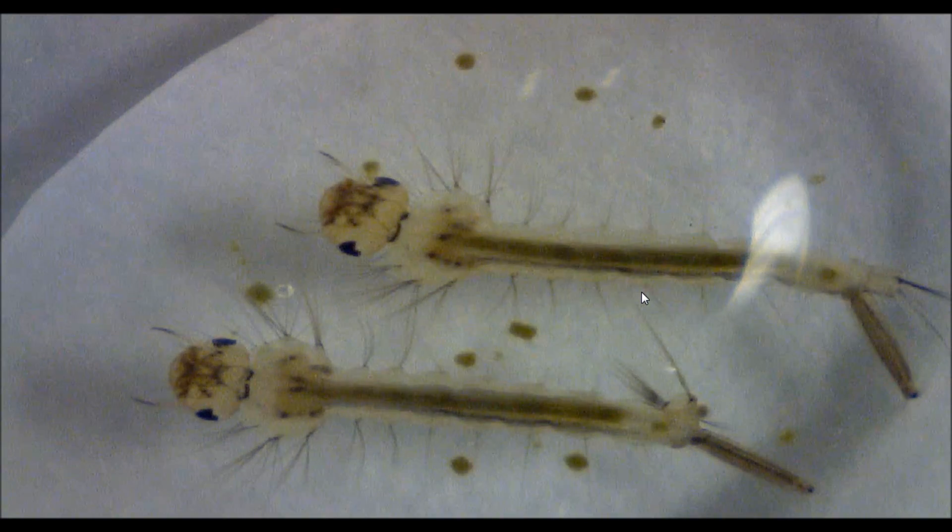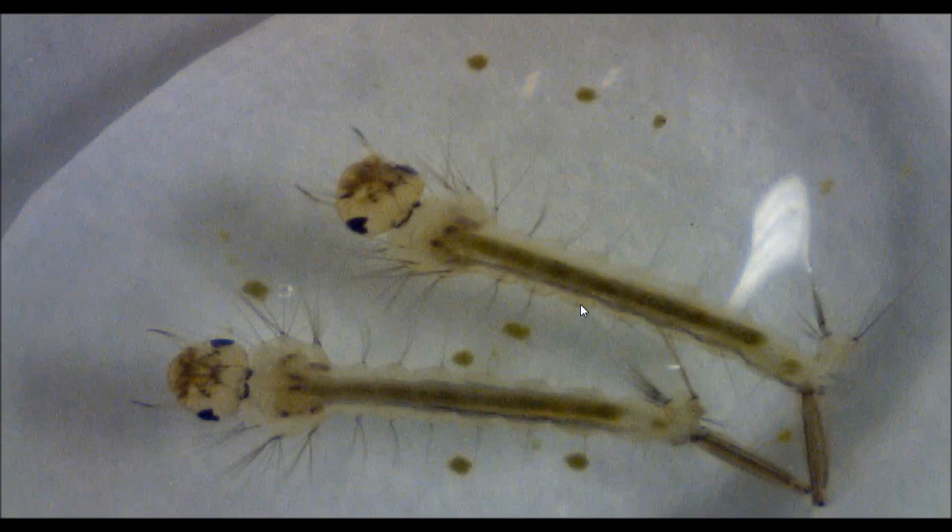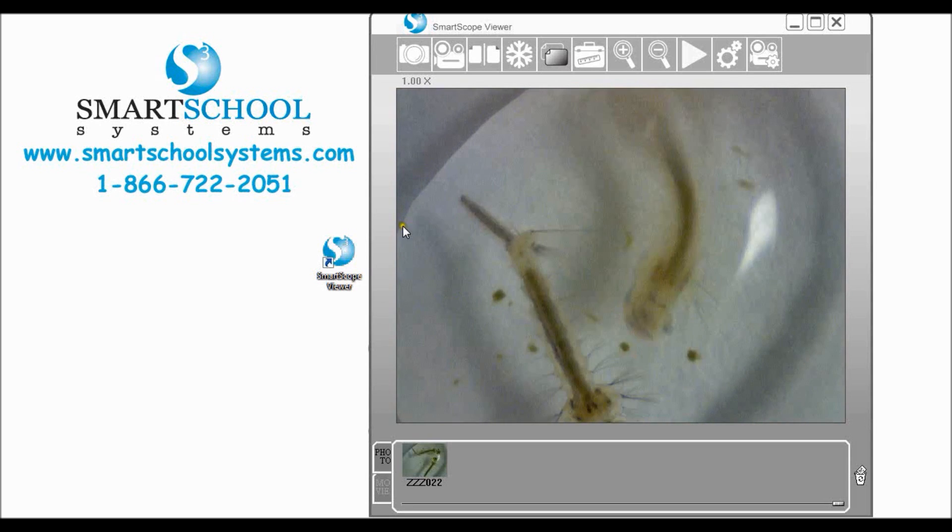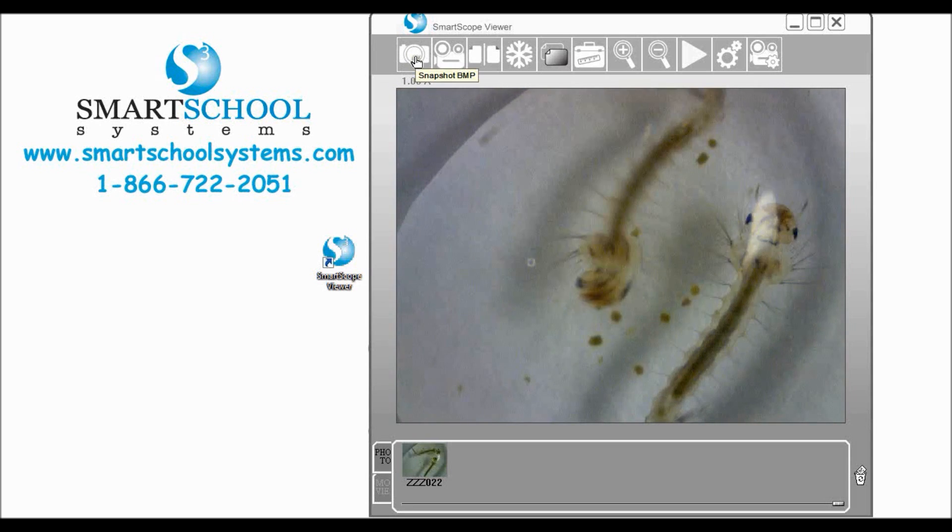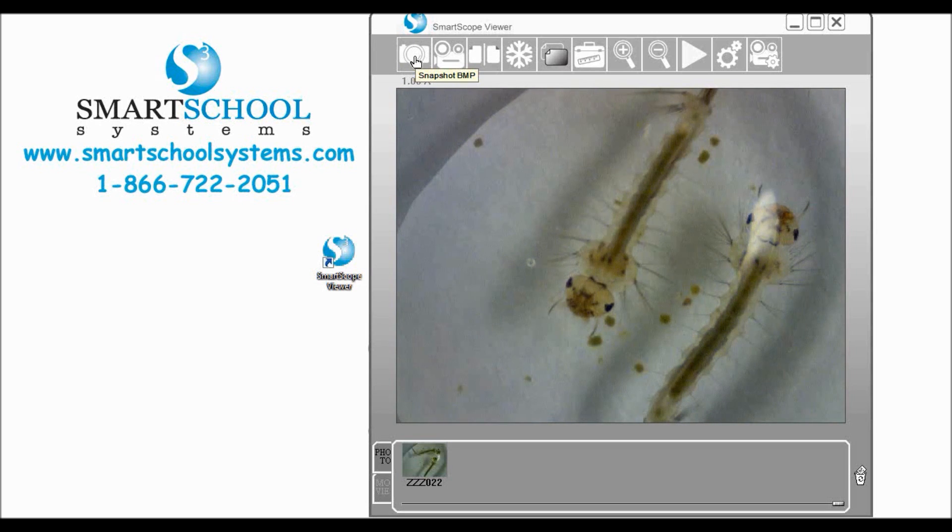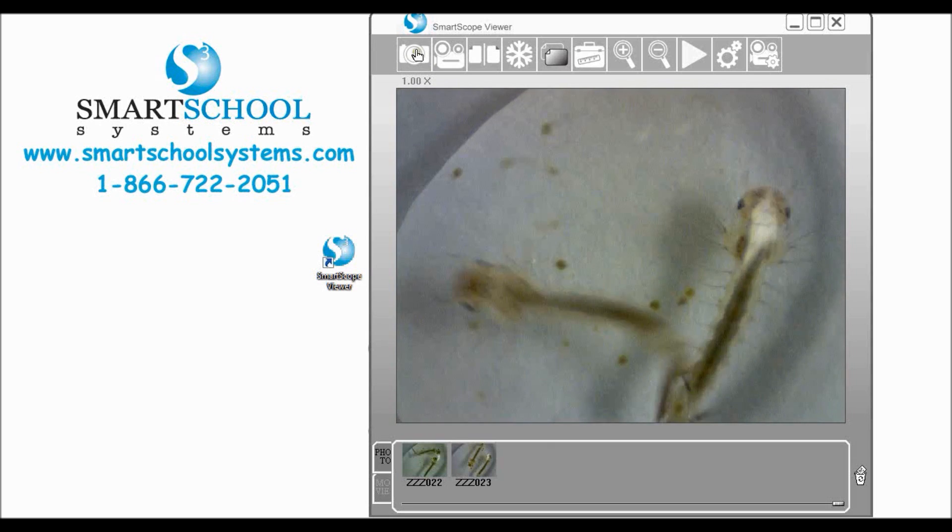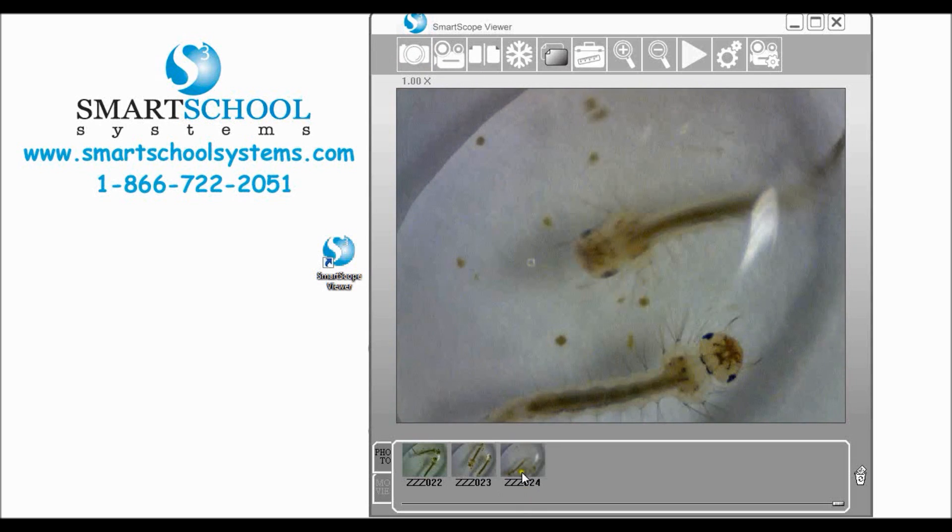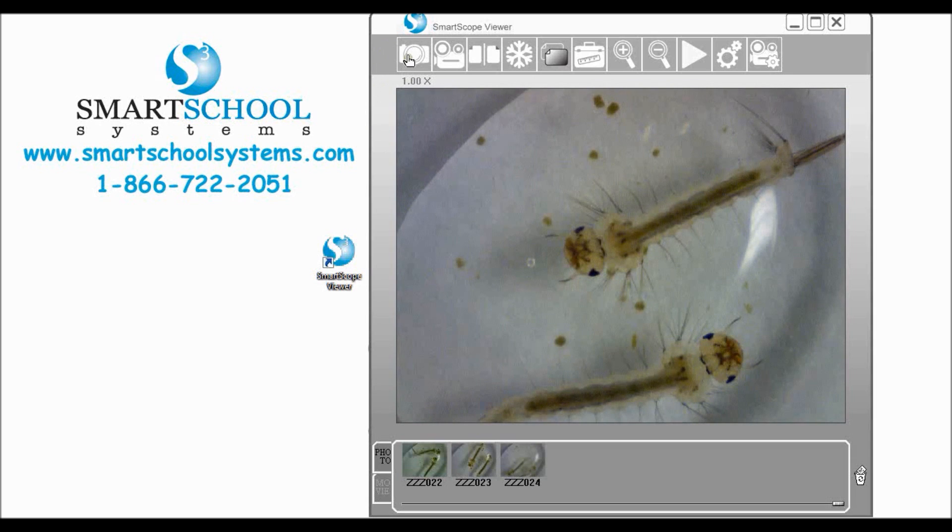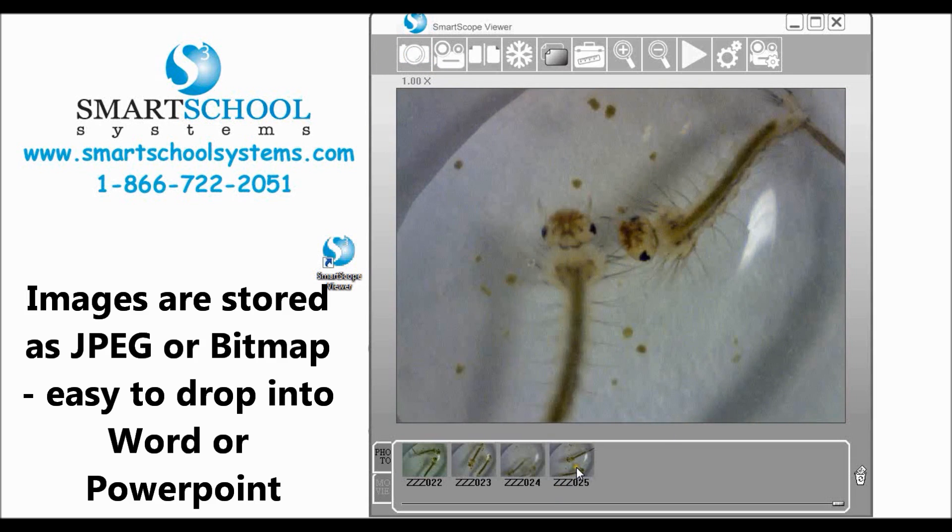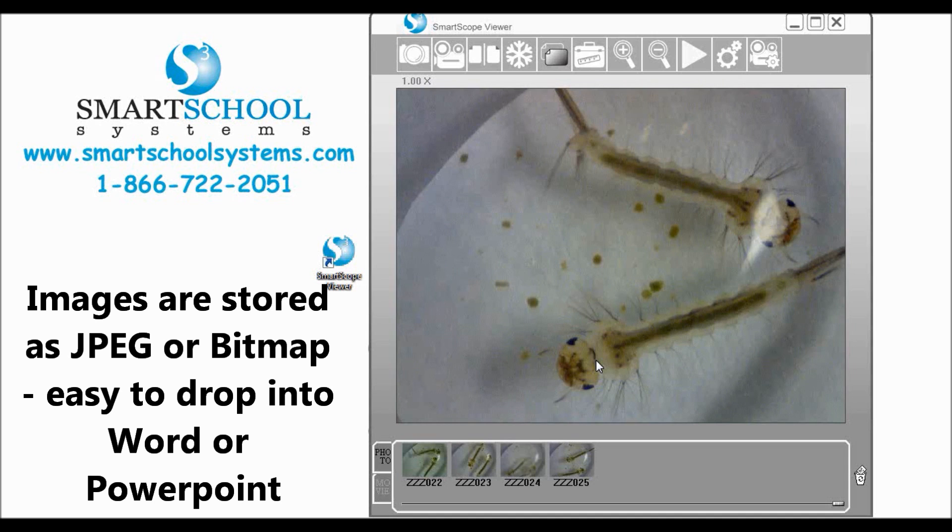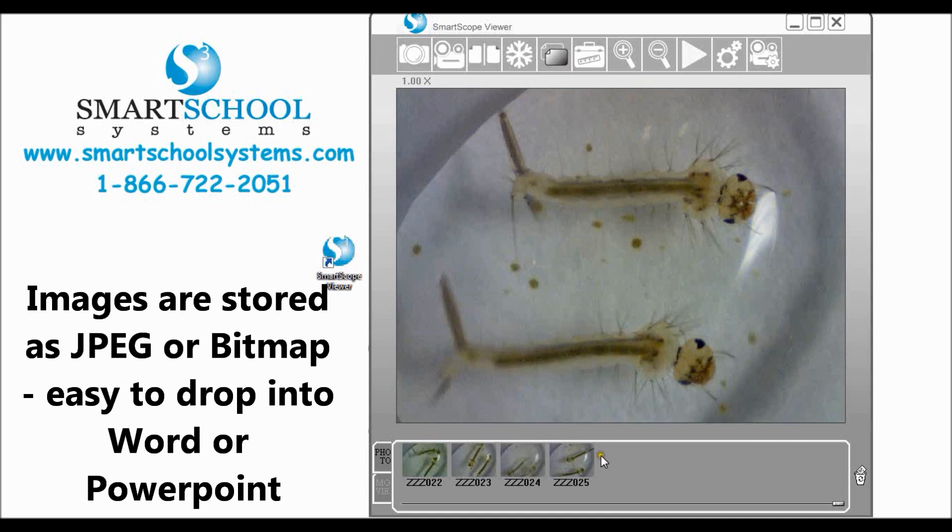We can come out of that by simply double clicking again. Let's move on up to our snapshot. Let's say we want to take a picture so we can click the camera icon and you can see as we do that it adds the images down here on our bottom preview image area. You can also take pictures by pressing the snapshot button on your SmartScope.